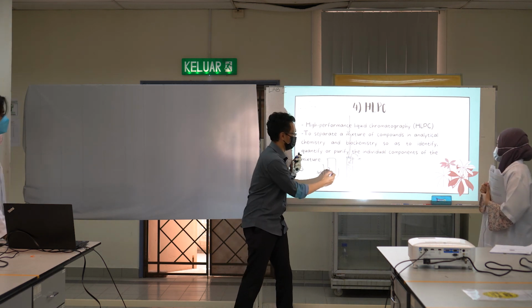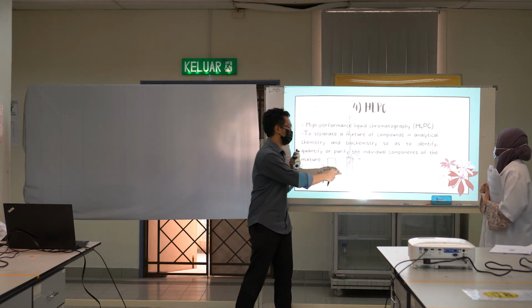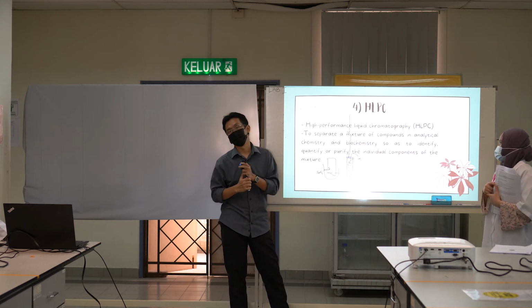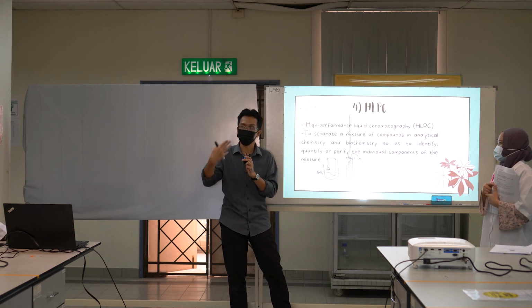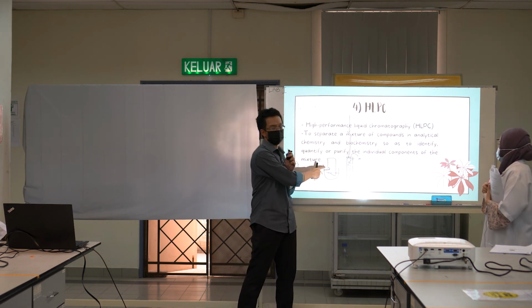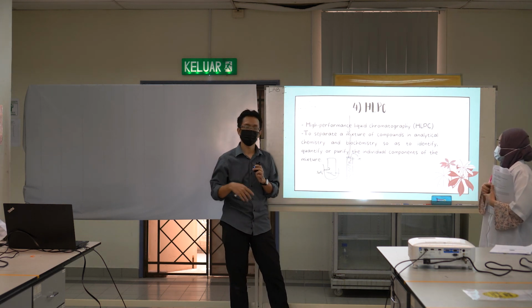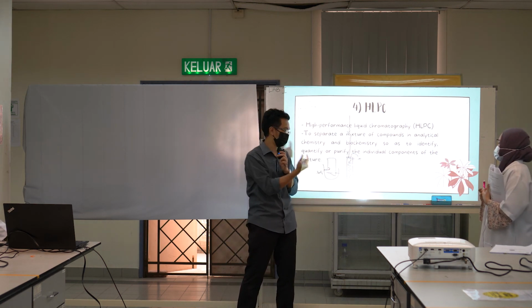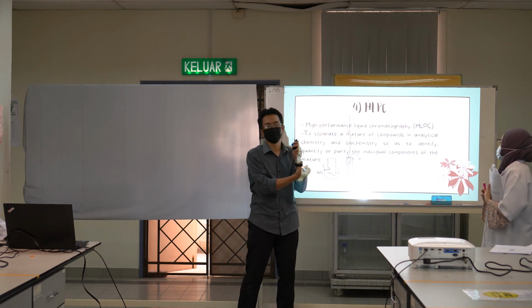So it is more controlled and you can replicate it. The thin layer method depends on how you prepare it, and some compounds cannot stick very well on it, whereas in the column you can compact the material inside.